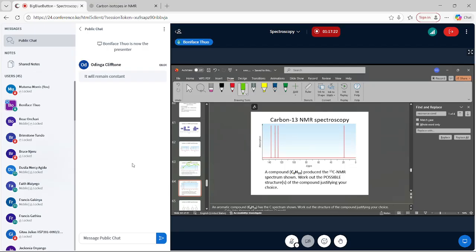And when we look at the chemical formula, we have 8 carbons. Since the peaks are of equal height, that probably means that each peak is due to 2 carbons. So we can say those are 2 carbons and 2 carbons. Okay, that's looking at the intensities.